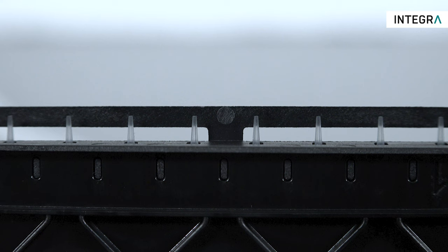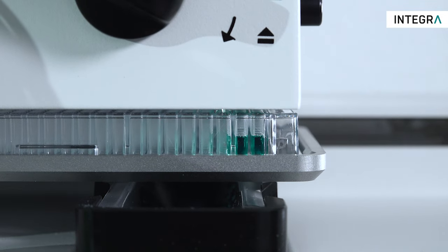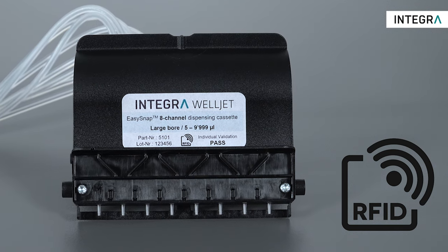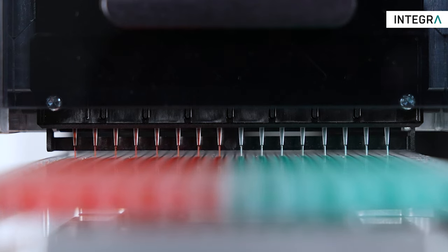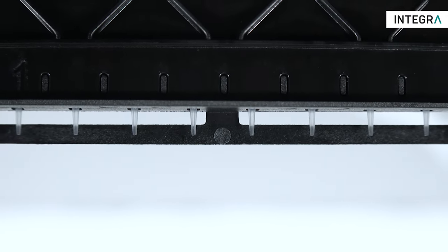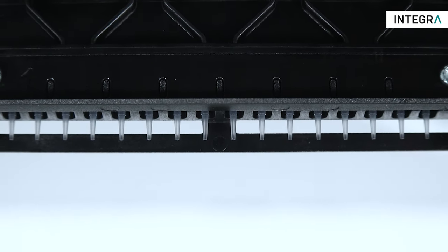A robust anti-collision frame protects the high-precision plastic dispense nozzles from damage. Removing the frame even allows you to dispense inside a well. An integrated transmitter allows convenient tracking of dispense volumes, so the instrument will inform you when it is time to change the cassette to keep your dispenses accurate and reproducible. EZ-Snap cassettes are delivered sterile and are available in 8- and 16-channel versions for even faster filling of 384 well plates.